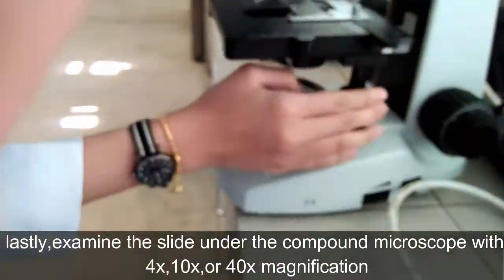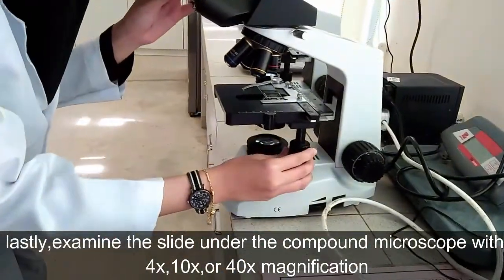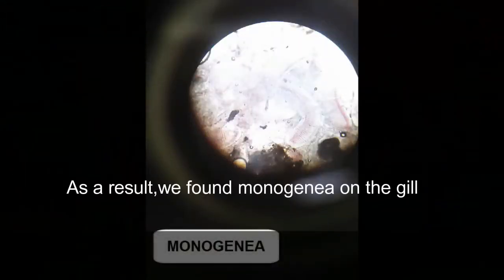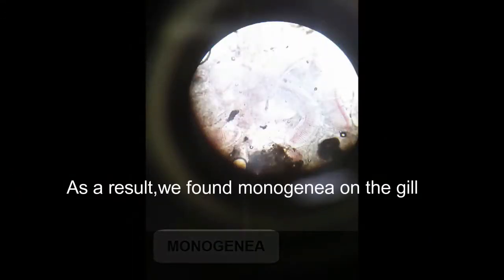Lastly, examine the slide under the compound microscope with 4 times, 10 times, or 40 times magnification. As a result, we found monogenea on the gill.